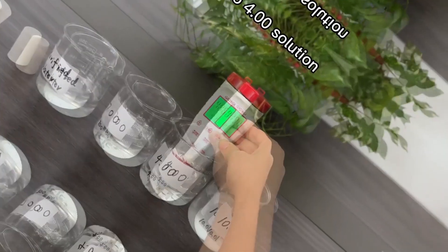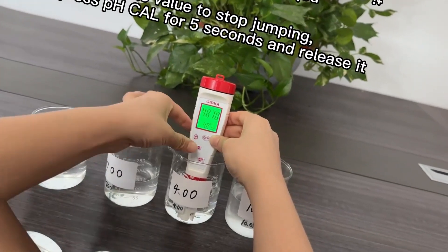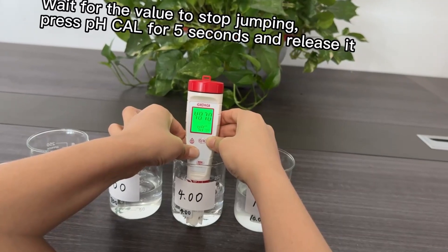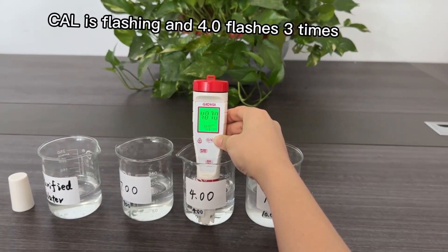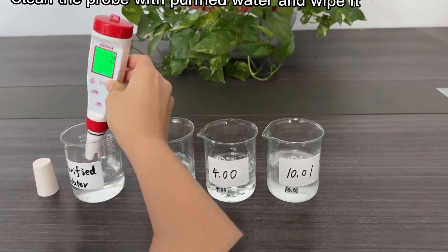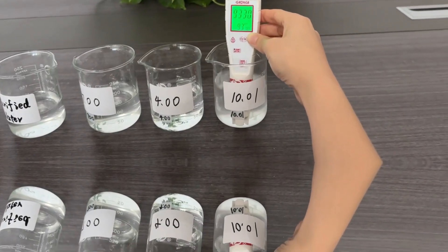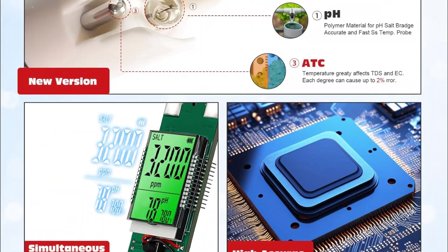Quick calibration is done with just a button press — ideal if you don't want to waste time adjusting parameters manually. It offers many features at an affordable cost, which is great if you're just starting and don't want to spend too much. It does not have a replaceable electrode, so if it wears out over time you will need to replace the entire device. However, with good maintenance it can last quite a long time.